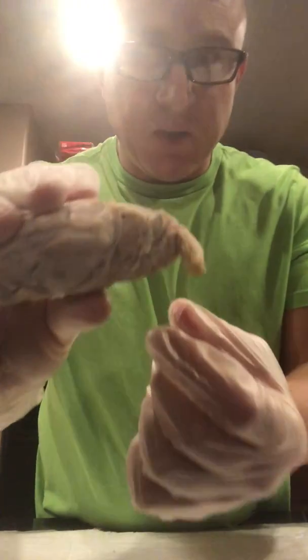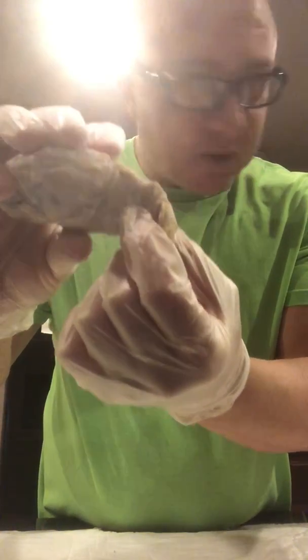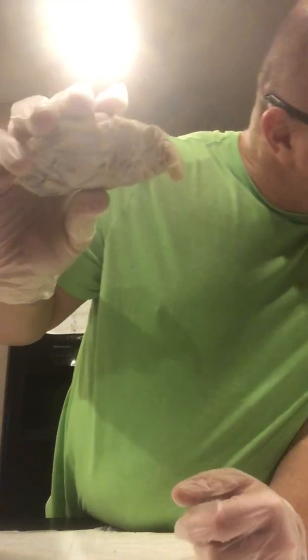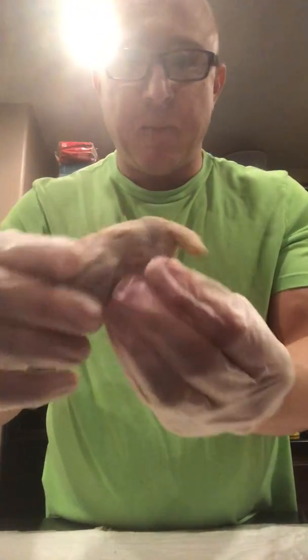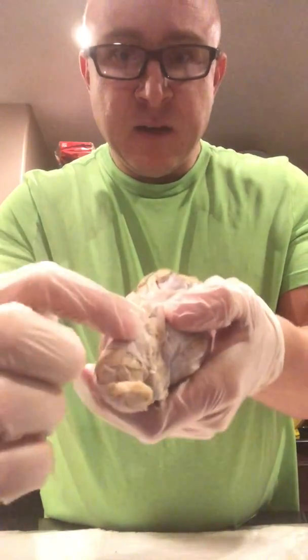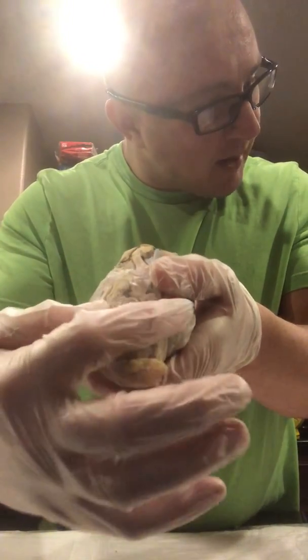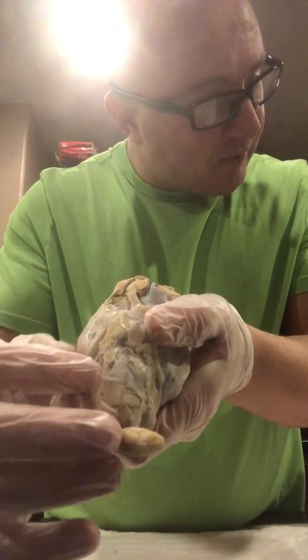The pons, as I said earlier, is going to be below the midbrain. And then the medulla oblongata is going to be below the pons. Cerebellum. The next is the cerebellum. The cerebellum is this whole area here. The vermis. The vermis is going to be right in the center that splits the cerebellum into two hemispheres. The lateral hemispheres are going to be on either side of the vermis.